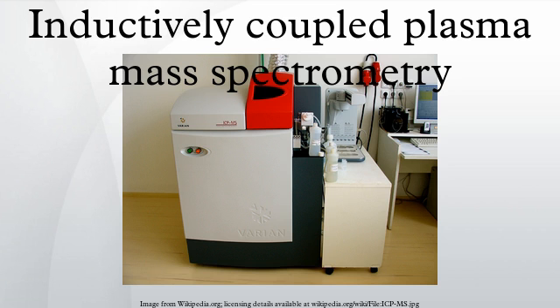First, argon is abundant and therefore cheaper than other noble gases. Argon also has a higher first ionization potential than all other elements except He, F, and Ne. Because of this high ionization energy, the ionization reaction is more energetically favorable than the neutralization reaction. This ensures that the sample remains ionized so that the mass spectrometer can detect it.